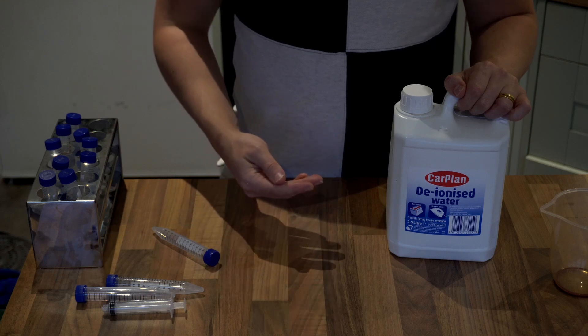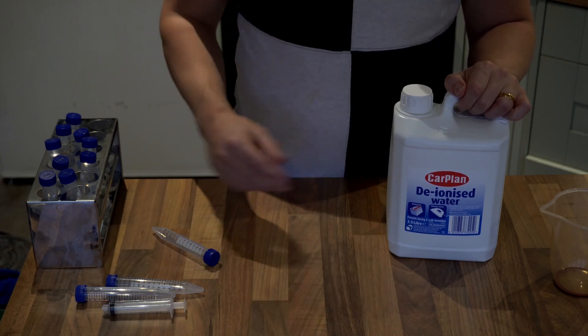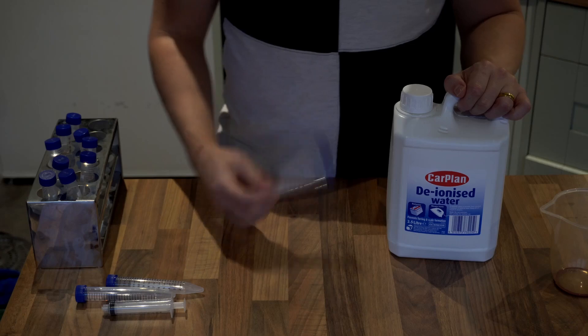This means you can store your cultures long term with just a couple of test tubes, some distilled water, and a pressure cooker.